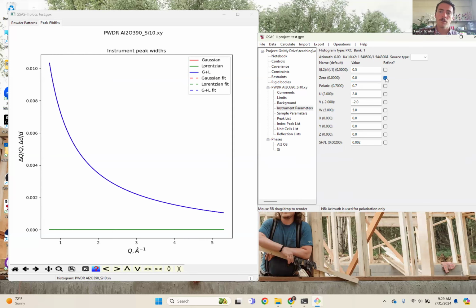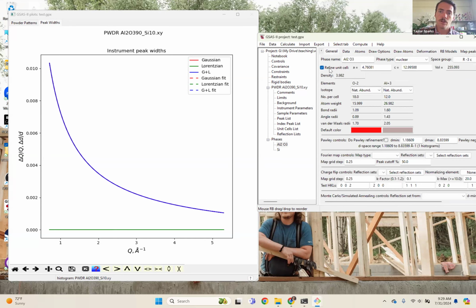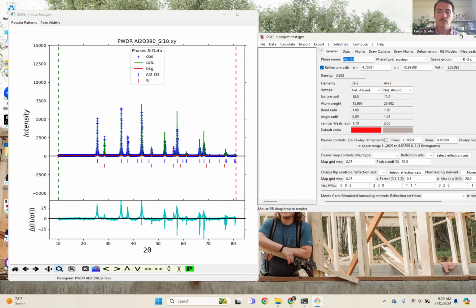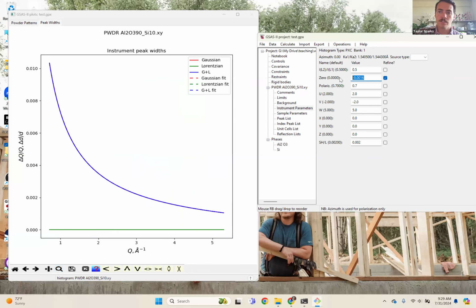If you turn it on, I bet it gives us an error, because if we have our 0 refinement turned on and we have one of these lattice parameters right here turned on, those are correlated features. So if we run it, it should give us an error, I would think. No, it's going to do it anyways. But you definitely shouldn't do that because those are correlated features. So let's come back up here to our instrument and set that back to 0.